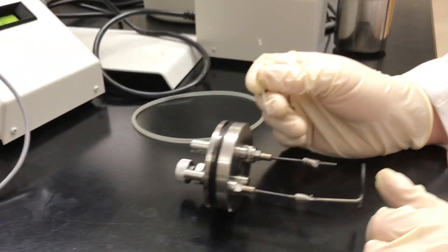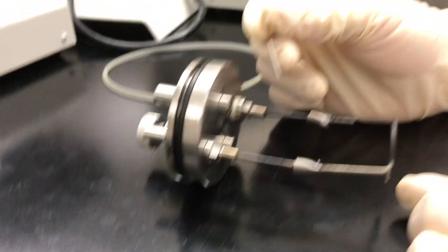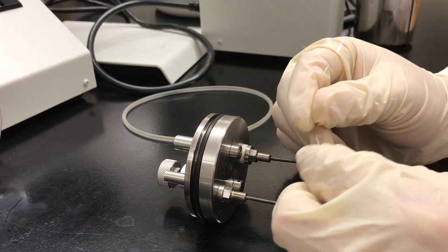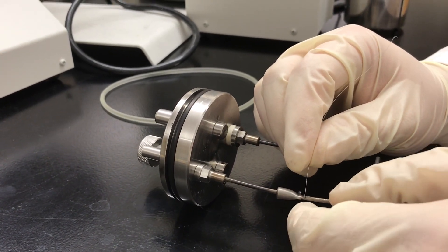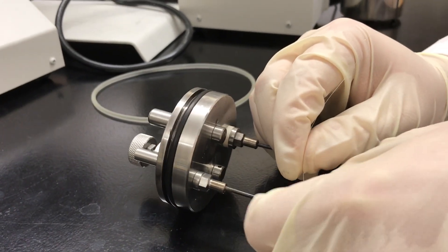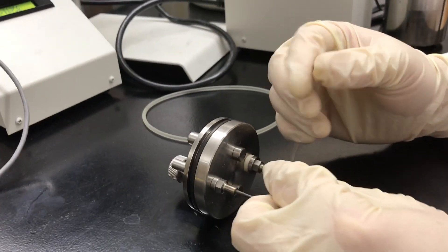Next we'll be setting up the actual bomb. Those two points right there are the electrodes, and you want to take your nichrome wire. We have 10 centimeters, so you're going to do about two loops around each side, leaving slack so you can manipulate it to contact your sample.